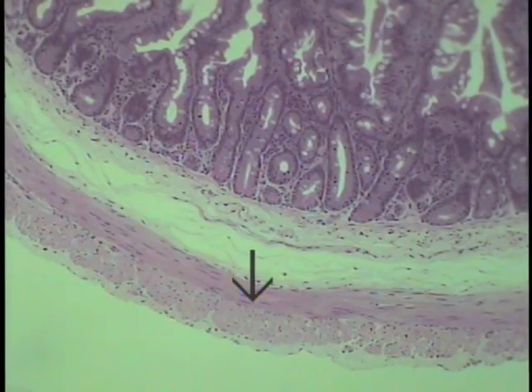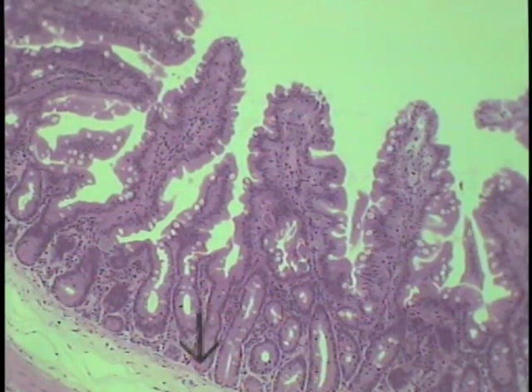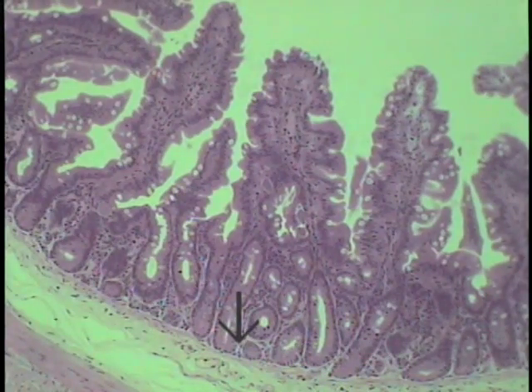Now, examine the intestinal epithelium lining the crypts and the walls of villi in this particular segment as well. In this particular series of slides, one should be able to see a little bit of a red hue at the very base of the crypts. This is where another cell type, in addition to goblet cells, enterocytes, and enteroendocrine cells, a cell type with very large red granules also resides, known as the Paneth cell. Examine it at increased magnification.